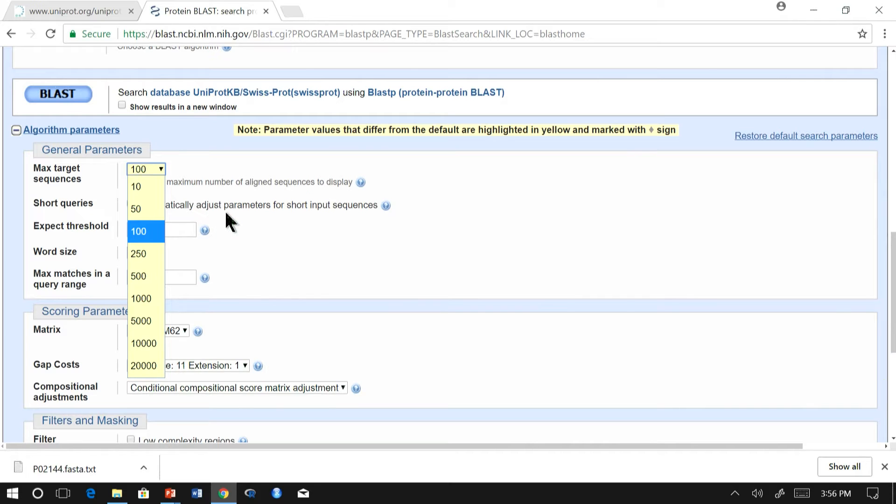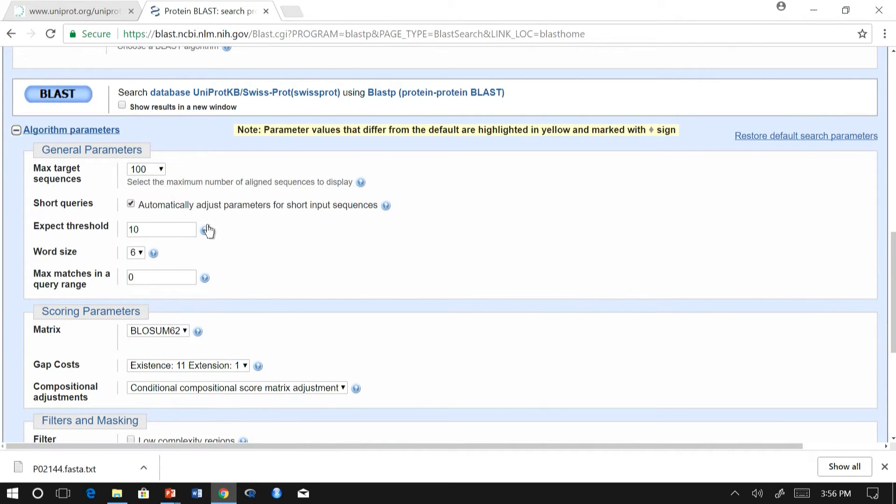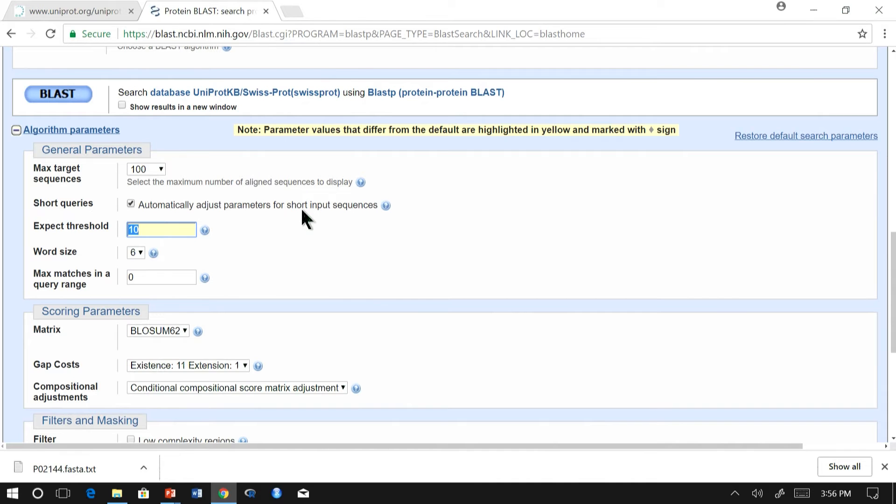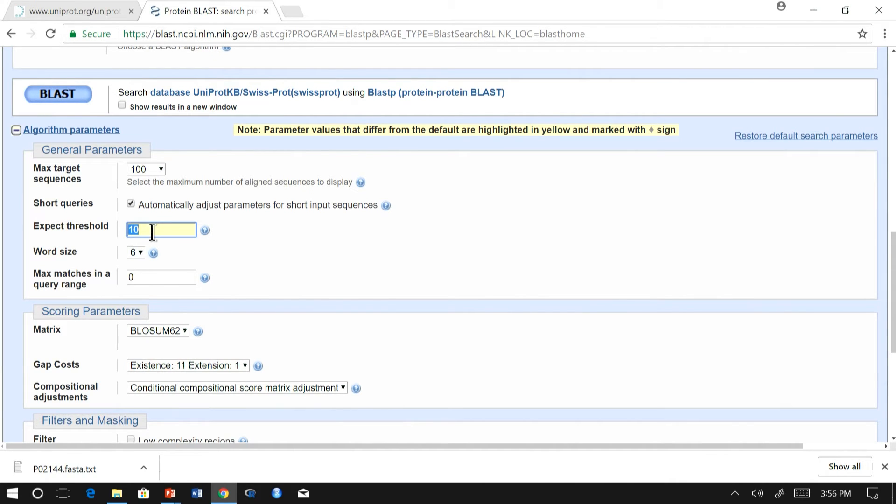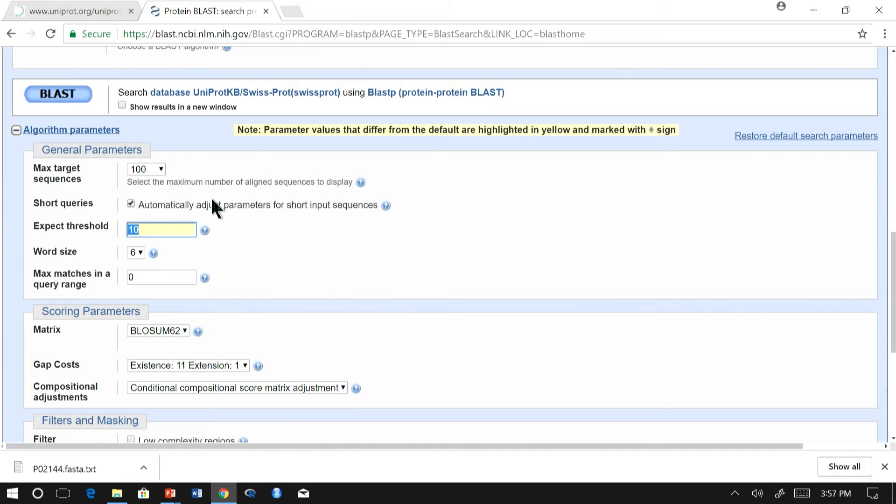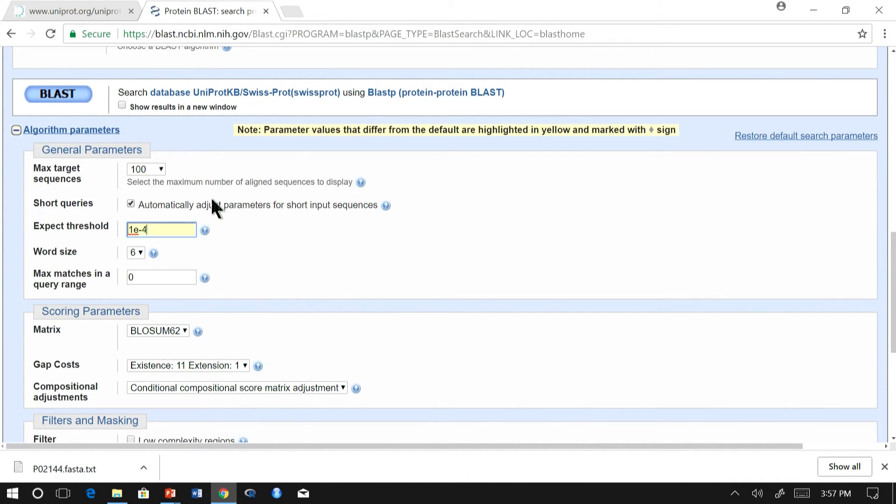Max target sequence - here you can set number of sequences you want to get. There's an expect threshold which is nothing but the limitation for the E value. Every sequence that is aligned with your query sequence will have an E value. And this E value is the expected number of sequences which has a score greater than or equal to the score of that particular sequence. We want very good match between sequences. You can restrict the expected threshold. For example, I am going to restrict to 10 power minus 4.